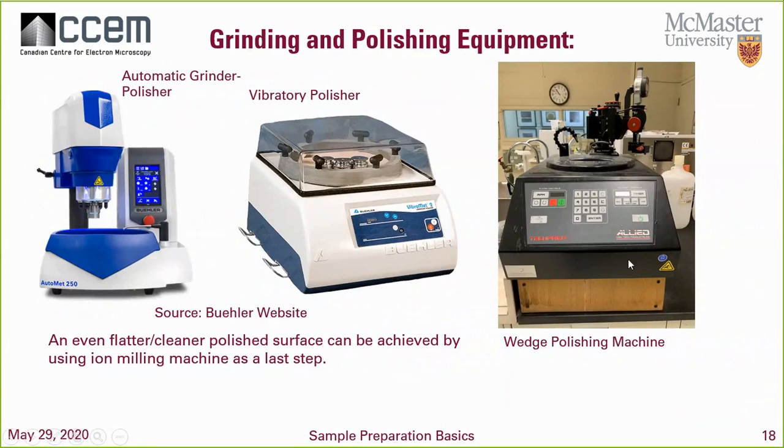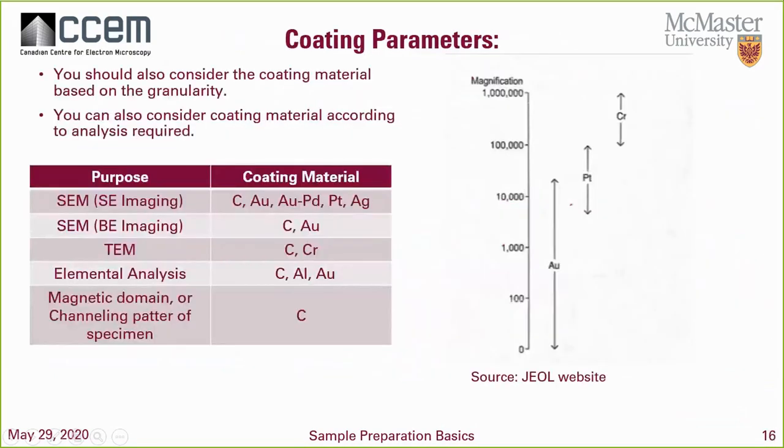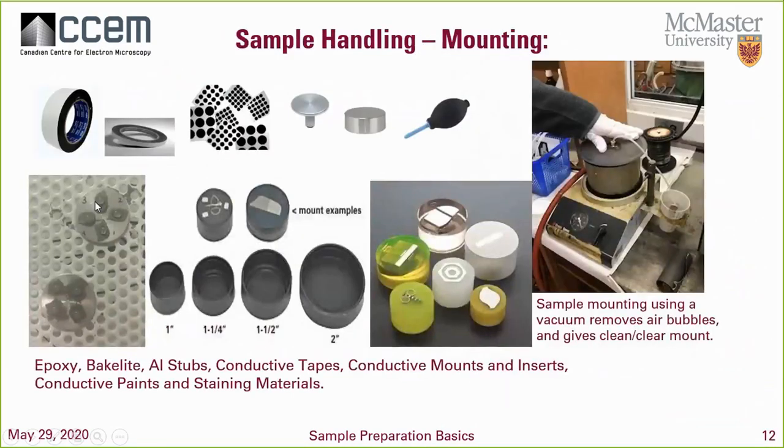So usually, as you can see here, I added it here. Let's say you had a wafer here, that polymer. What you can do is the same way that I did here: you just mount it on the stub, add a little bit of paint on each corner to hold the sample, and then add a coating. That's one way that you can do that.